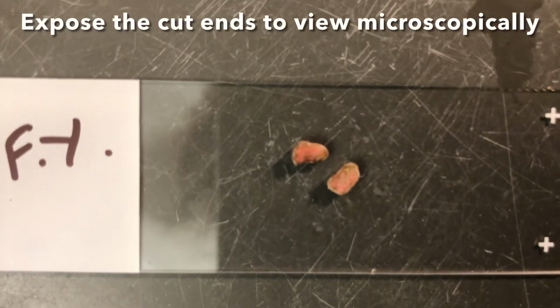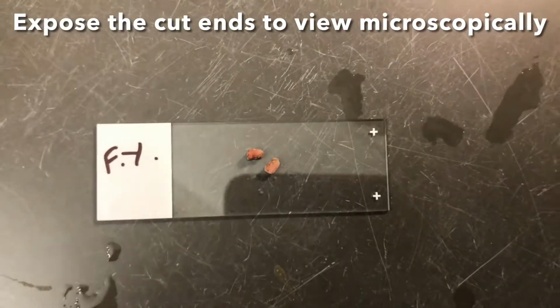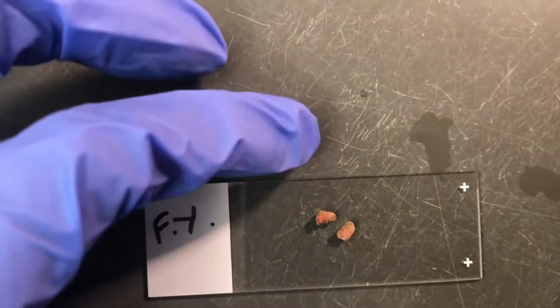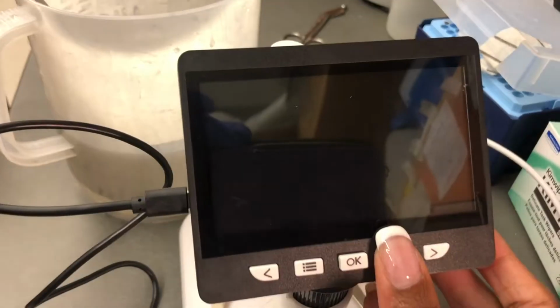Okay, so that's the part where you want to observe under the microscope. From our first slide, you could see that the stain was pretty strong. So we definitely need very little stain, and for a shorter time.